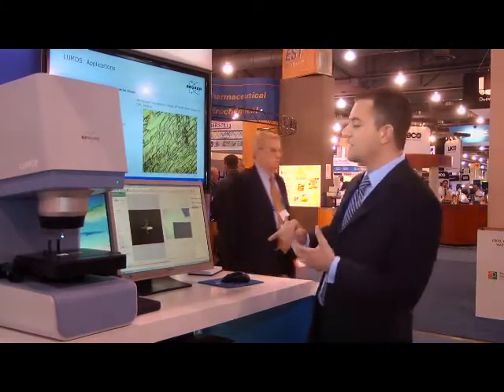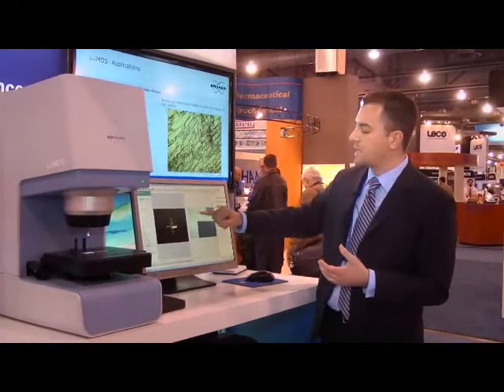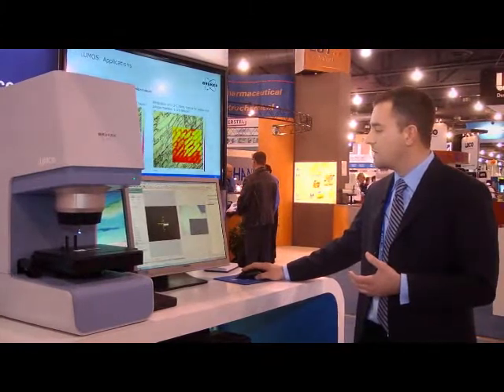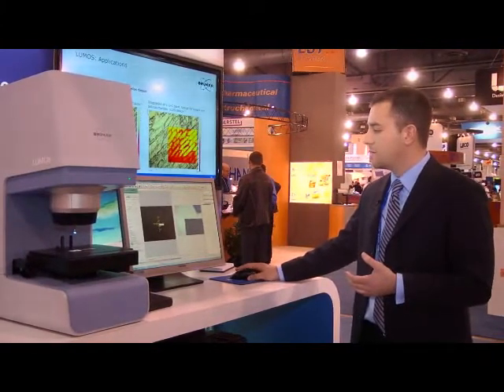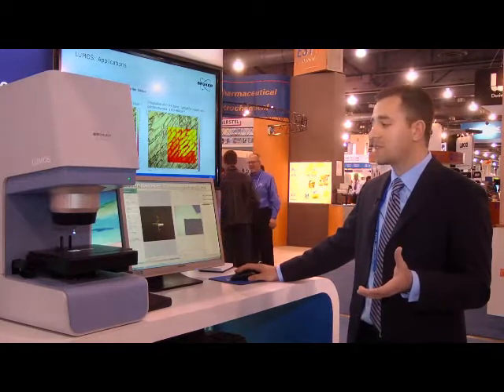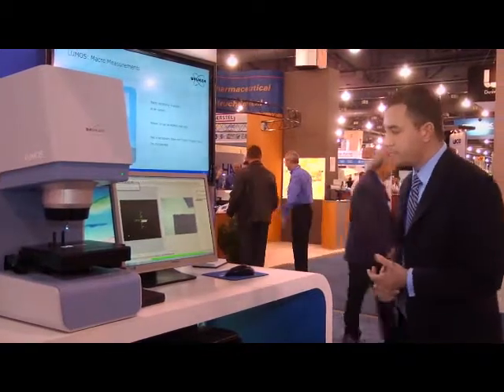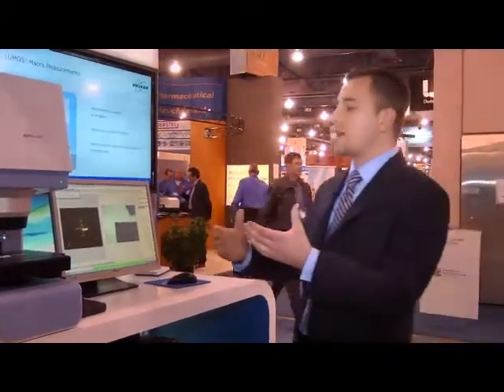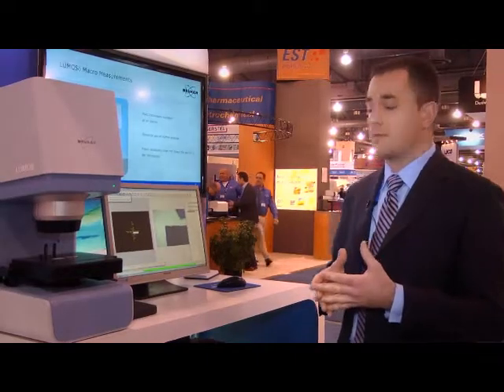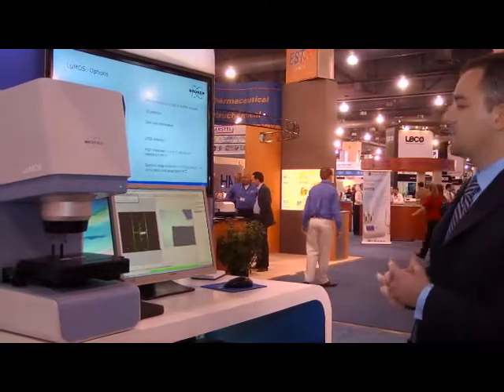So what I'm really interested in doing is I want to see if there's a difference between my blue ink, my black ink, or no ink. So what I'll do is I'll take individual spots, here, here, and here, say next, name my sample, name the number of scans I want to do, and go ahead and click measure. So now the LUMOS is automatically going to take a new background based on the aperture I chose, and you can see the aperture blades close into a position.